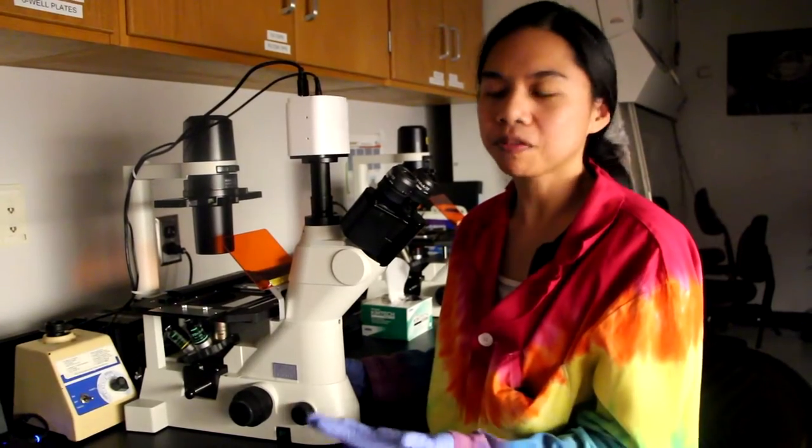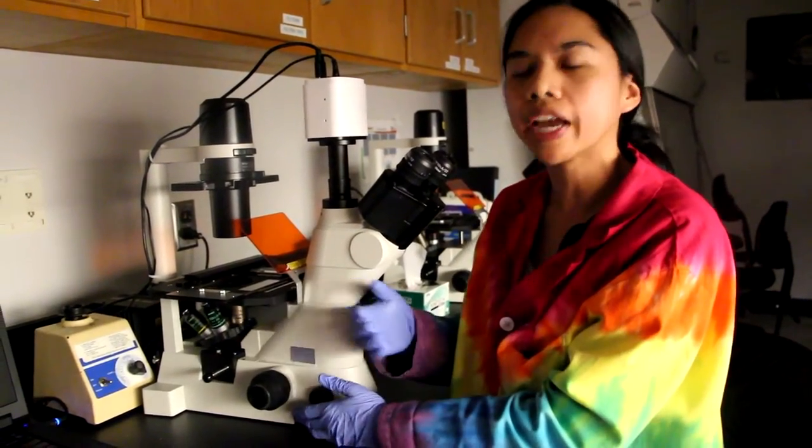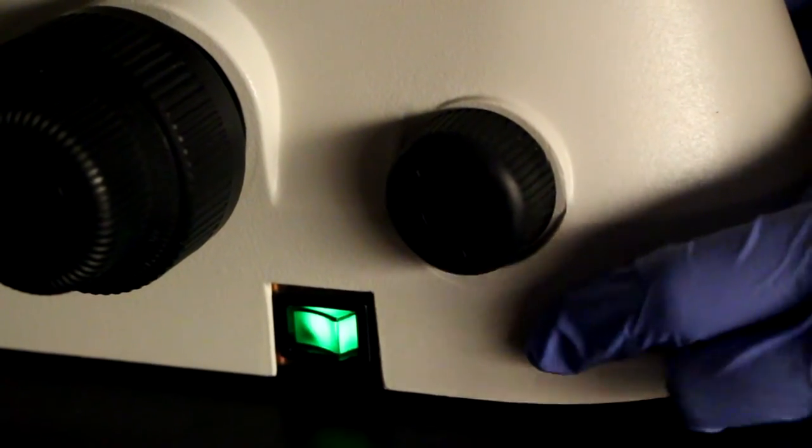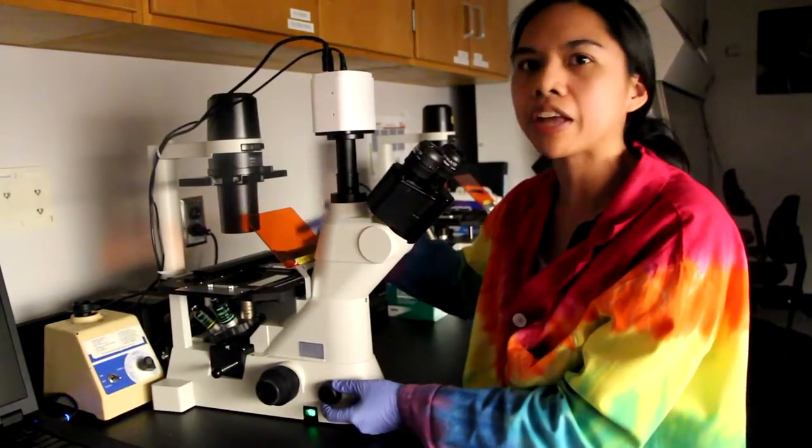Obviously we need to turn on our microscope, first of all. So in order to turn on the bright field or the white light, the switch is right here, the screen switch. And then there's also this dimmer knob, which can actually change the intensity of the white light that's passing through the sample.